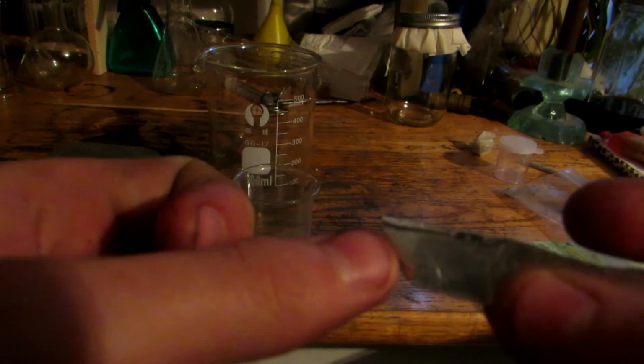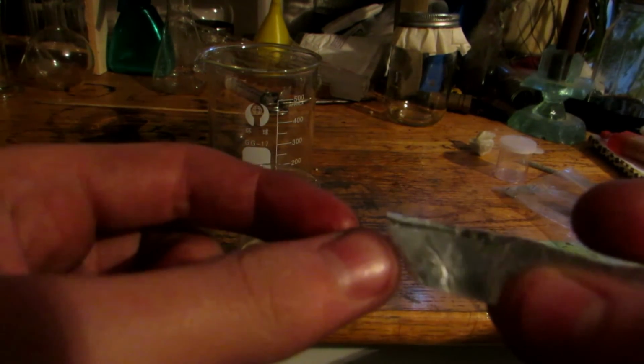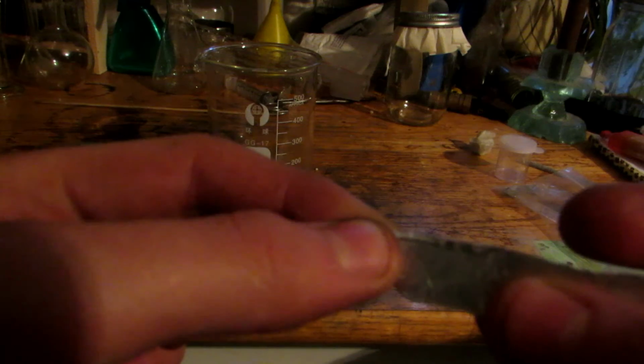Okay, so I'm rather excited now. I don't know if you could see. Oh, it's really difficult to see. Right along there you can see that line across there. This is a bit lighter over here than on this side. So this is the part that was in the solution, and it's been slowly dissolving, which means we have potassium hydroxide, which is rather dilute. And I will show you how to purify it in a moment.